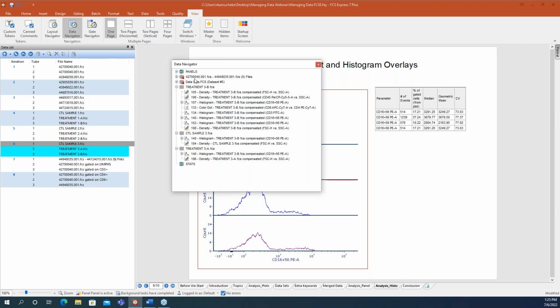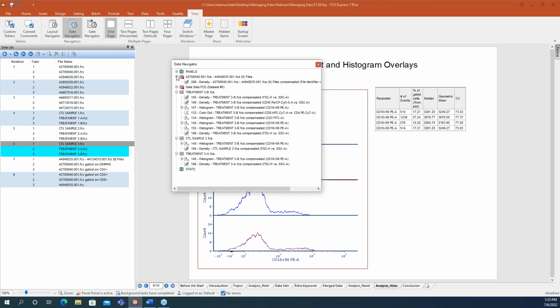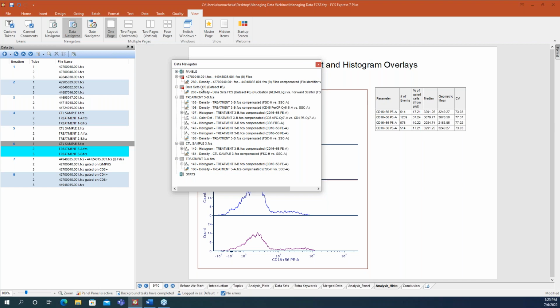You see up here, I have a data file here that is no longer in my data list. Actually, I think it's back. I think I just didn't update it. And then I have my data sets here from when we had added all those data sets and then deleted those ones out. This is really helpful when I'm trying to explore what's happening where and when.